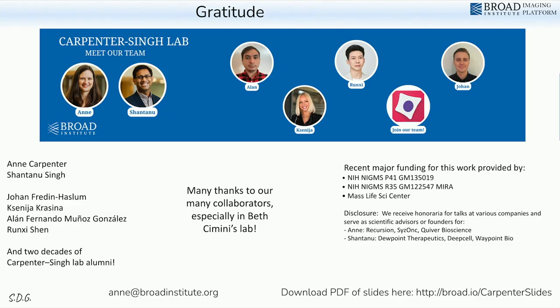No. But I would point you to a blog post we wrote called "Help! Interpreting image-based profiles." Sadly, it's a few years old, but it's still pretty up to date for how you make sense of the profiles. So like I see a cluster of genes, or I see a difference between disease and healthy. What exactly is changing?